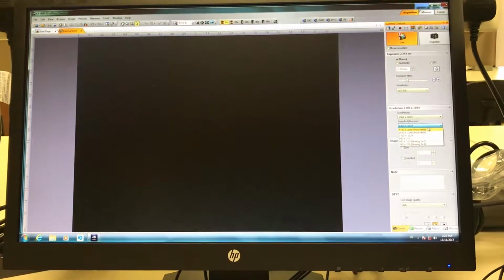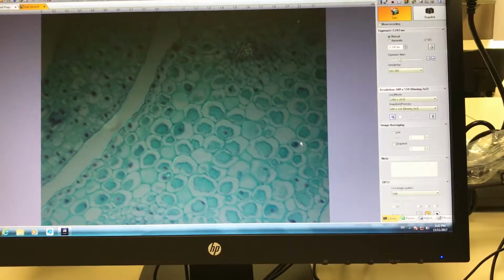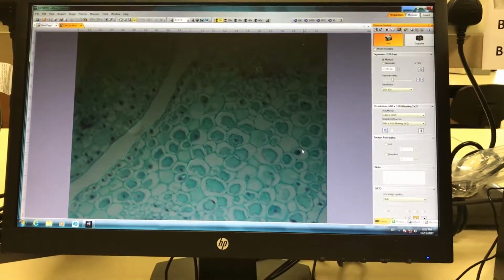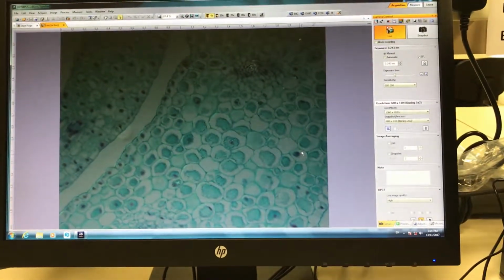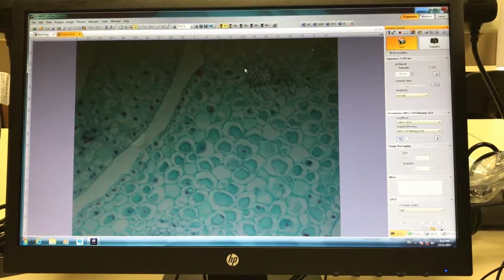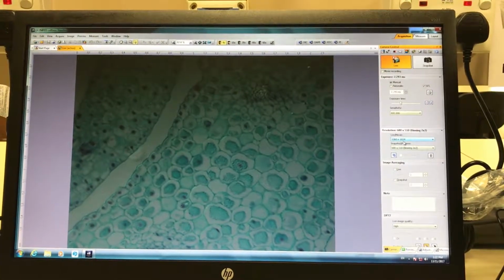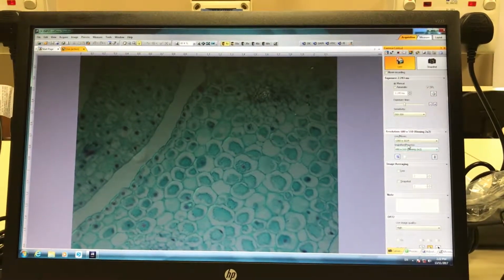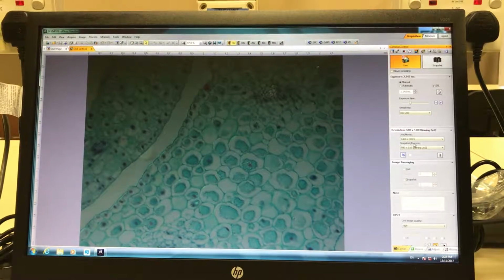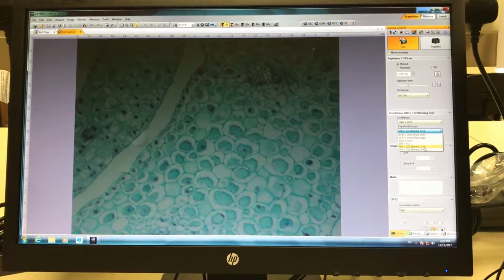Okay, so then we have also this binning mode. Binning mode is a way to magnify or to amplify the signal. So a 2x2 binning mode means that it will collect the signal from the neighboring 4 pixels into one, and it will give you a signal that seems boosted by 4 times. But the problem is you are sacrificing your resolution. So instead of the original resolution, you actually lose resolution by 2/4. Okay, so that is binning.